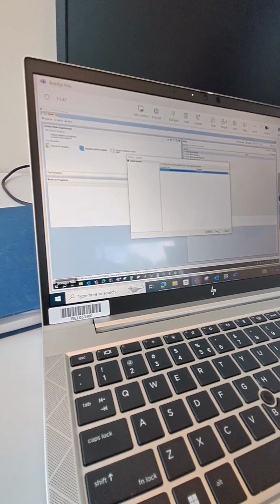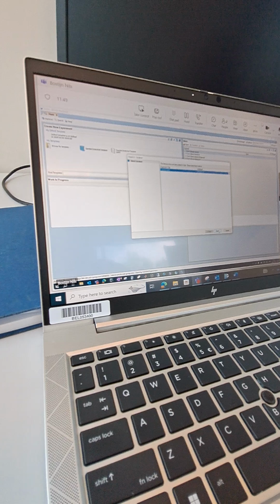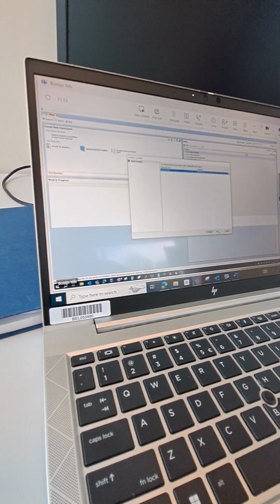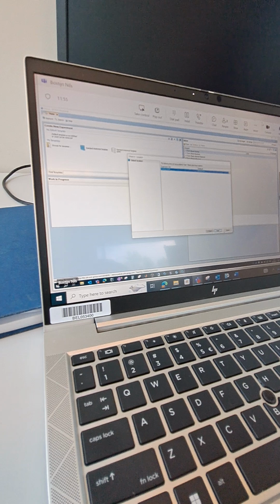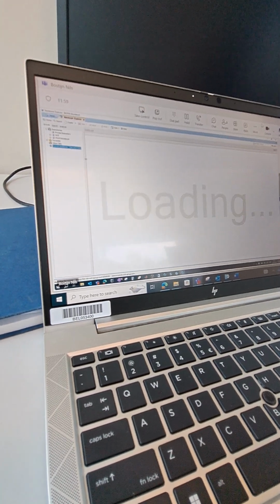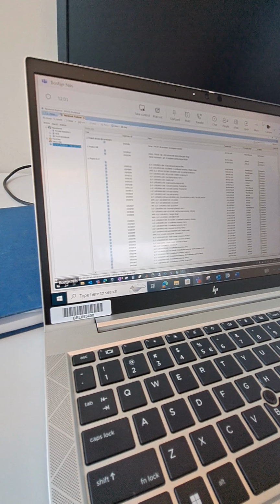I won't continue here because otherwise I will create one and I don't need it. I will just now go to one of mine so you can see what the next step is. I will just take one as an example.